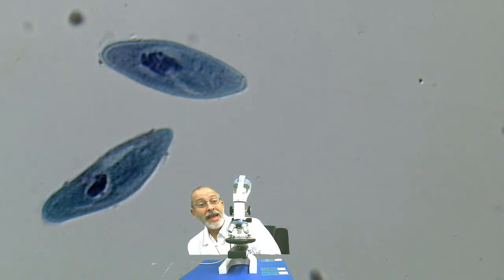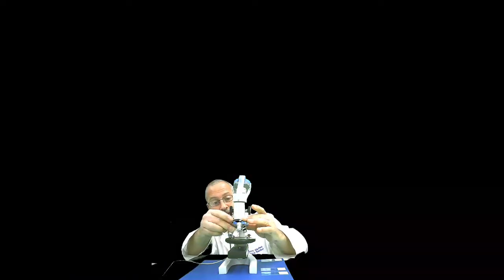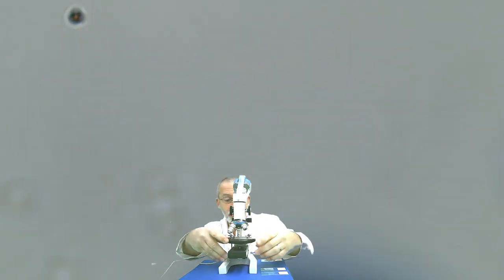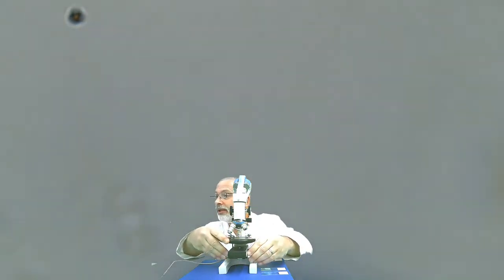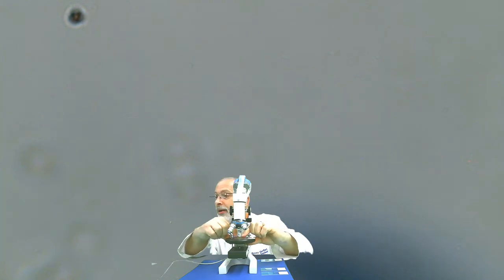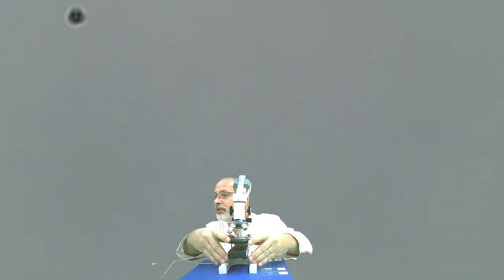All right, now I'm going to turn it over to 100 times magnification for another illustration. Let me boost up the lighting here a little bit as I look for those that we were just looking at a moment ago. Ooh, let's bring that back.